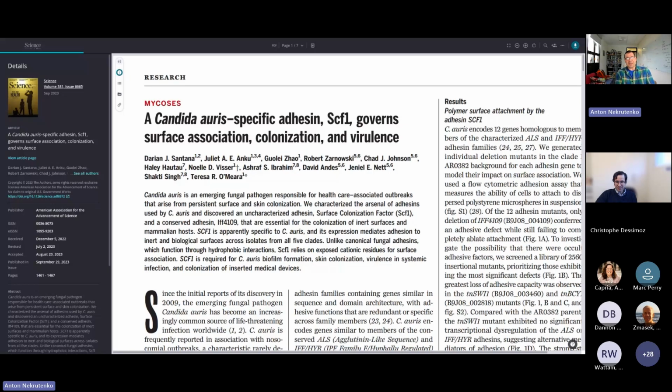Why am I replicating this? Because, of course, in this case, I know what the final result is. So it's also a good way to validate that what I'm doing is actually correct. But what I'm going to present to you here is a great way to do generic differential expression RNA-seq via BRC Analytics. So what I would do is, papers like this usually specify how they deposited the data.